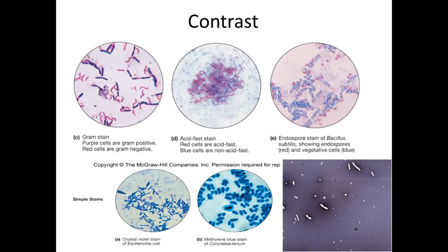So my students in lab get annoyed with me when I tell them to draw, before they come to class, all the things that we're going to look at under the microscope. And I'm like, because I want you to have a frame of reference of what you're looking for. Because some of these slides that we looked at were fecal samples. So in addition to the bacteria, there's literally a whole lot of crud on the slide. And students are like, oh, is this the organism? No, that's literally feces. You've got to know what you're looking for, right? And so with simple staining, too, a lot of times you're staining stuff or not staining stuff that isn't what you're looking for. It's good to have a general idea of what you're looking for.